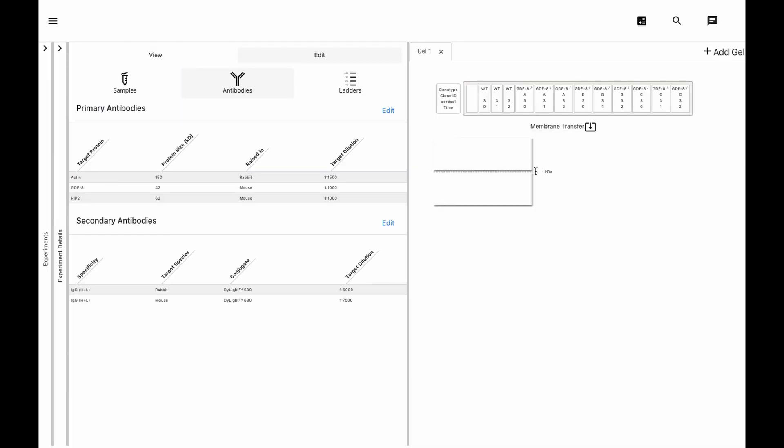First we'll cut the membrane at 100 kilodaltons, and we can also do that cut vertically if we wanted. We'll just pick our antibodies and now assign them to the membrane.